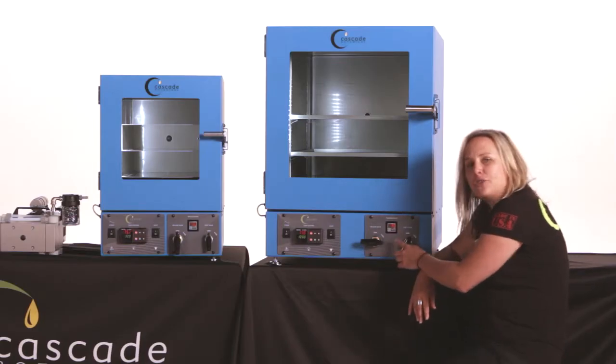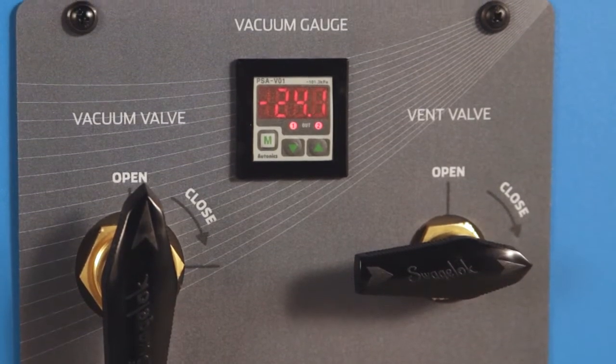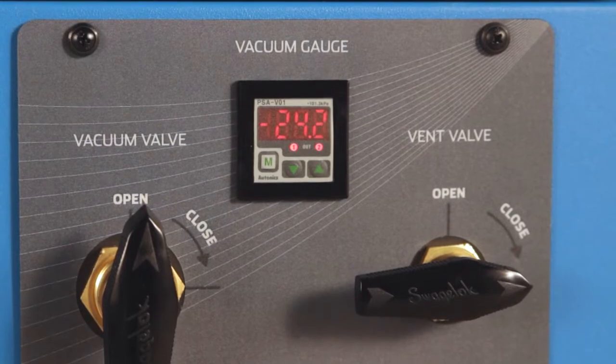Here's our digital vacuum gauge. This still reads in inches of mercury, but the large digital display is much easier to read when you want to check on your pressure levels during processing.